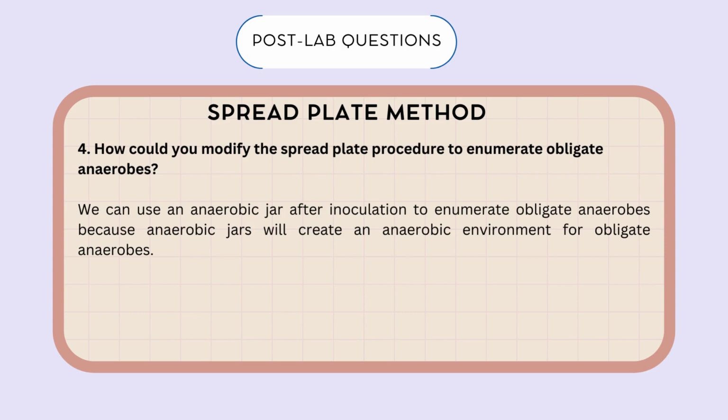Next, how could you modify the spread plate procedure to enumerate obligate anaerobes? We can use an anaerobic jar after inoculation to enumerate obligate anaerobes because anaerobic jars will create an anaerobic environment for obligate anaerobes.